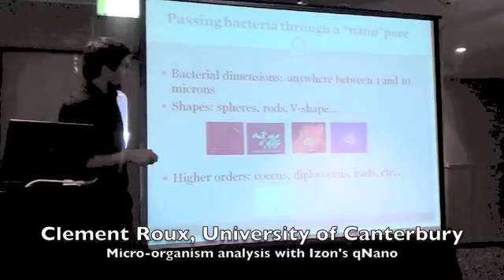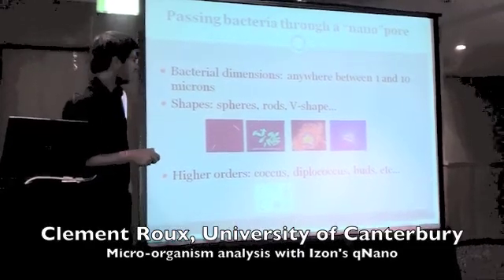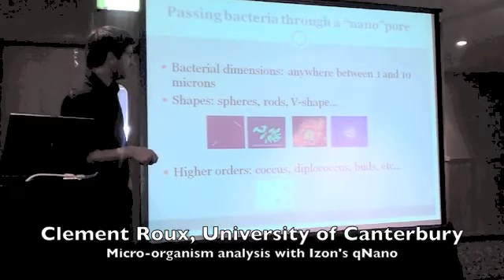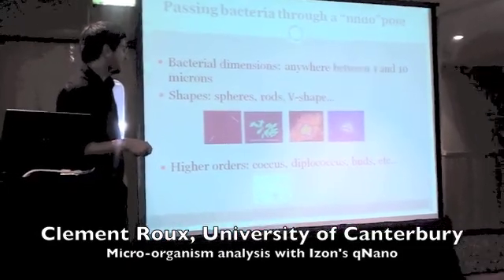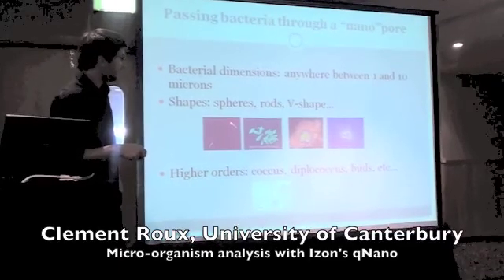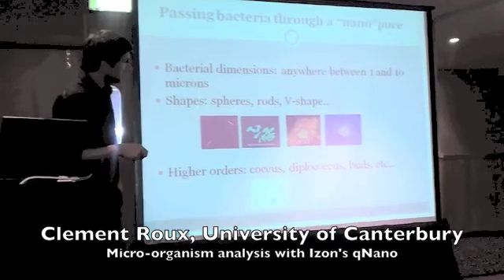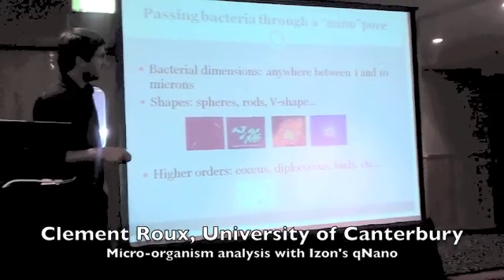I've selected 4 pictures. 3 of them are mine actually. This one, and this one. This one was taken by the most famous microscopist for bacteria up in Hawaii. So you might encounter things like Fusobacterium, which is a very long rod-shaped bacteria. The dimensions are typically 10 microns in length and 1 micron across.